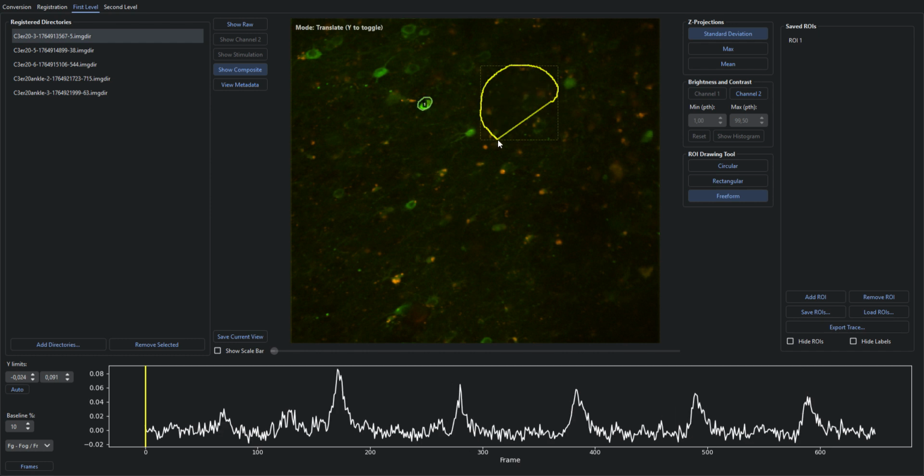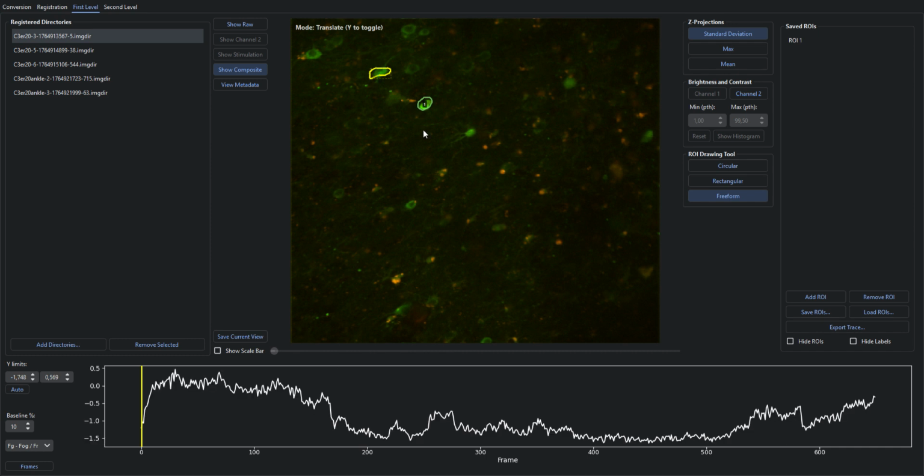It's just gonna draw a straight line to the beginning, which is really neat, I feel. It's gonna be really useful, especially when you're drawing like this, right? You don't have to draw the whole way. You just release it, and it's gonna connect it back to the first point.